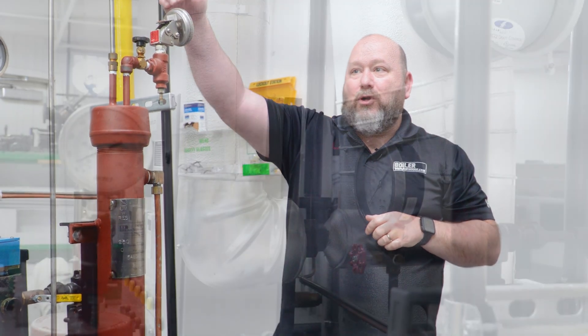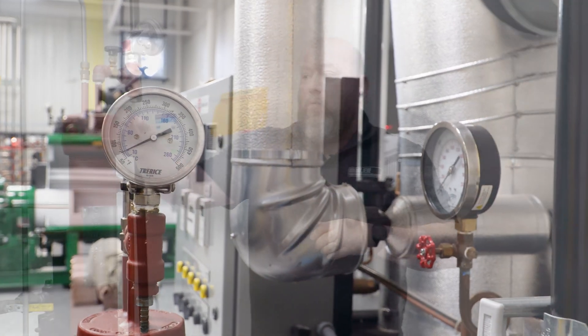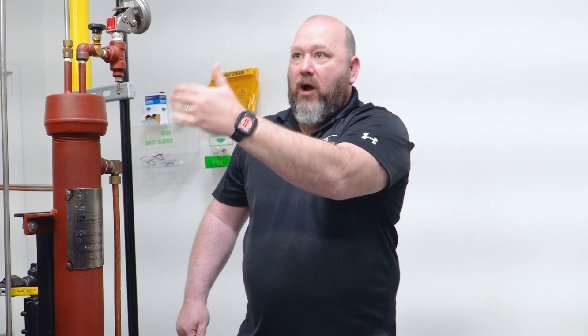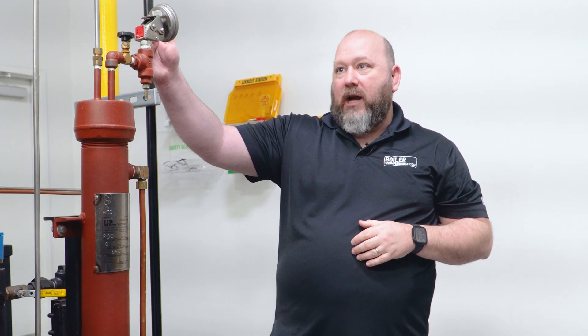You also have a temperature gauge so you can make sure, before you put your hands near it, that it's at a safe temperature. Normally you'll have a line here that runs flow for a little bit — you let it run, make sure it's at the temperature you want before you take your sample, then take your sample once it's where you need it to be.